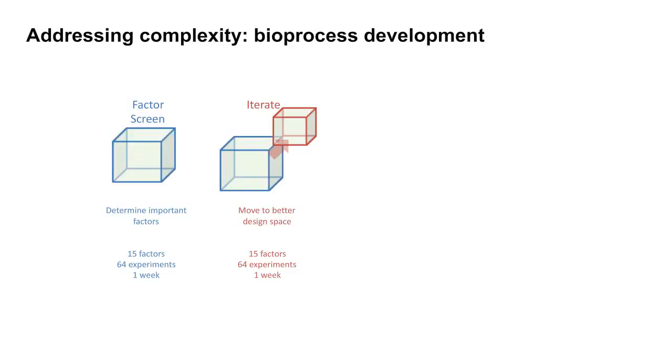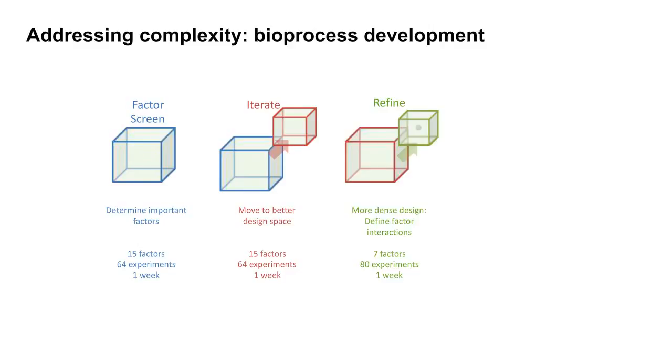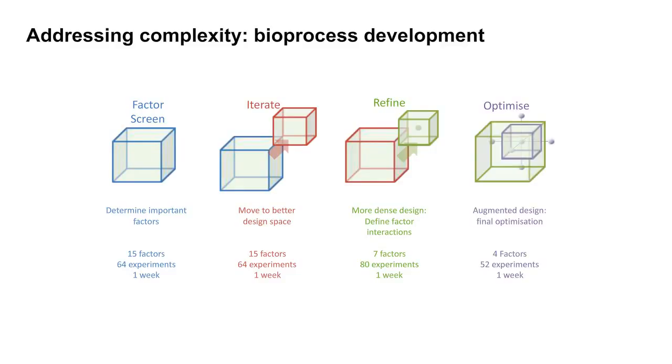Luckily for us, biology is filled with these cases where there are many potential interactions, but the vast majority of them within the particular part of the problem space that you're looking at don't matter. That gives more experimental bandwidth to start to refine and unpick which of these interactions are truly mattering. And having identified what were the key factors driving the ultimate result yield of this particular industrial enzyme meant that we could finally unpick the true interaction that was driving this entire system.